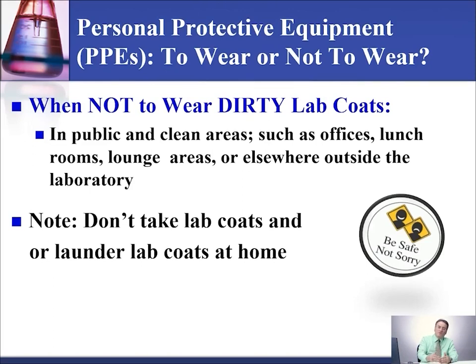When I was in America, we used to have a company that came and took the dirty lab coats, washed them, and brought us the lab coats. That's why each staff member should have 3 lab coats: one on them, one in the locker room, and one in laundry, just in case you have an accident, then you have an extra lab coat to wear.